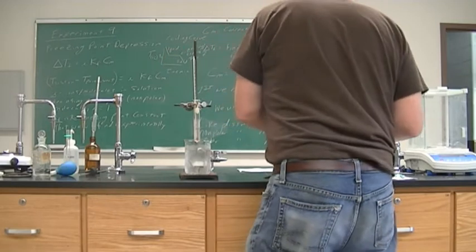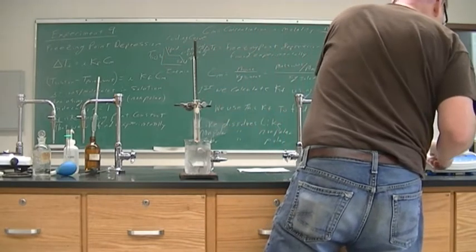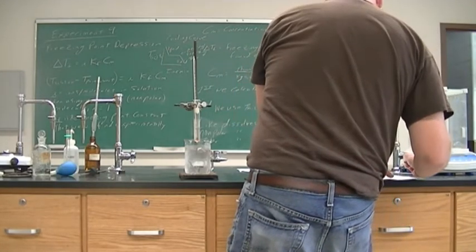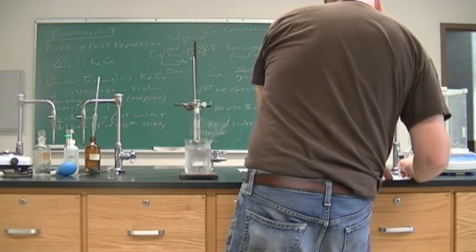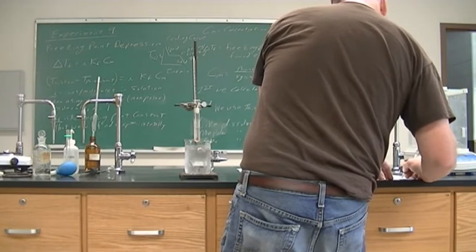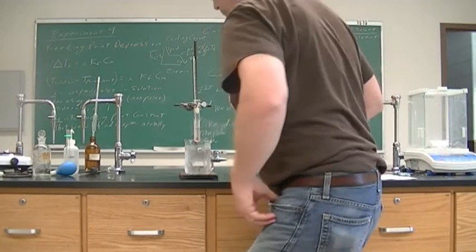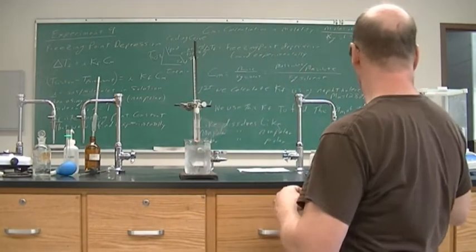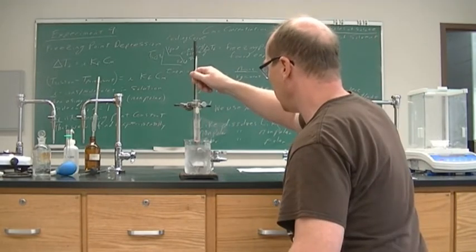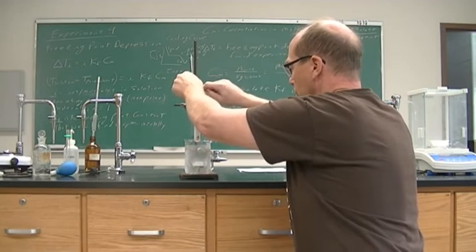And we're going to make sure that we dissolve it. Let's see if I added enough of that. That was 0.1159 grams. All right, so that is between the 0.11 and the 0.13. All right, so our mass of naphthalene is 0.1159 grams. Now, before I freeze this, I need to dissolve it.